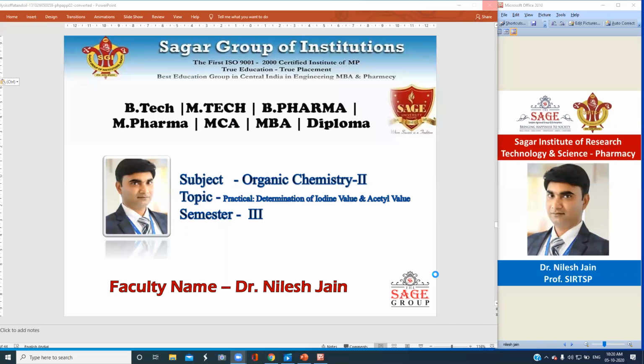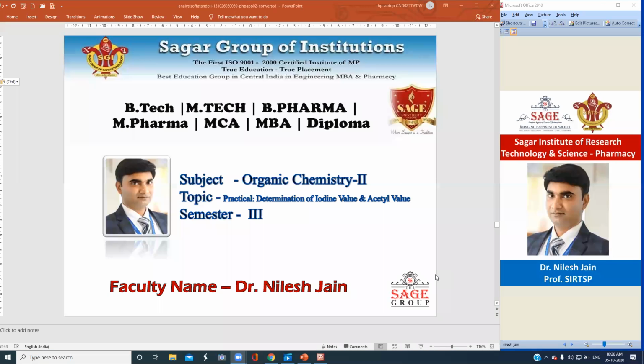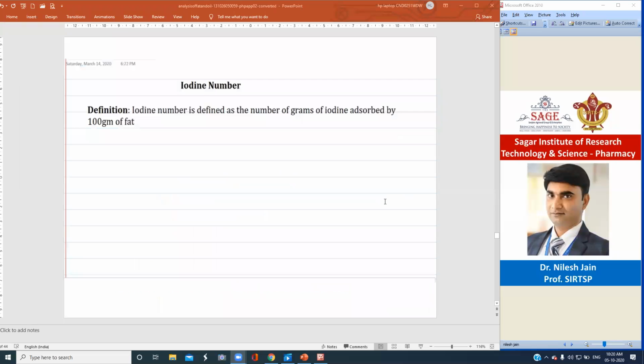Iodine value is basically to determine the unsaturation of oil or fats, the number of double bonds present in the oil sample or free fatty acids. They absorb the iodine at their double bonds. So let's continue our class with a video, which describes in brief the principle, definition and procedure.